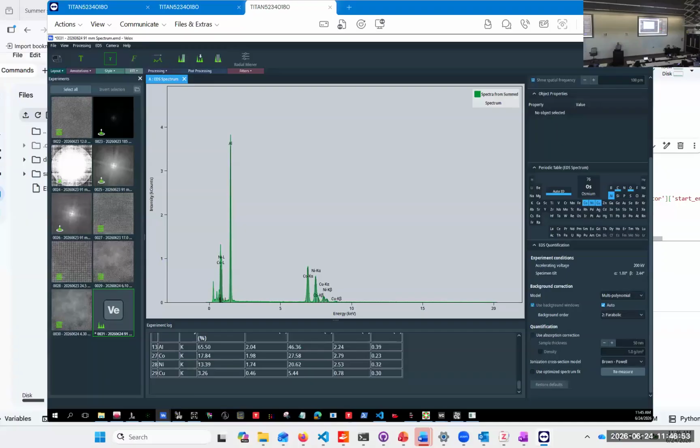But all of these softwares do have the same capabilities, right? Because we need that from a physical point of view.